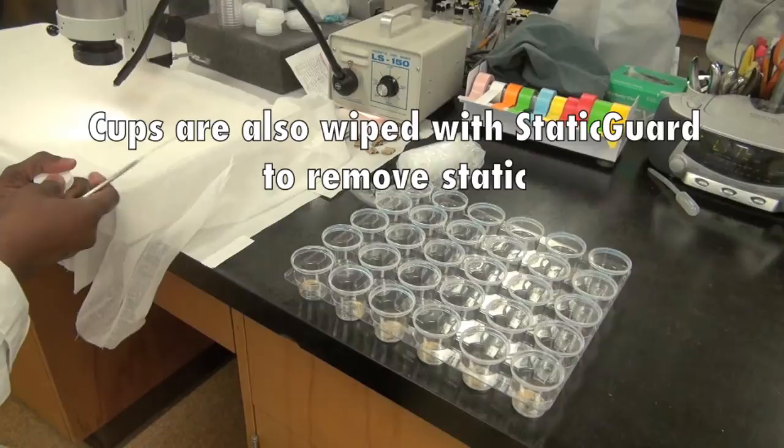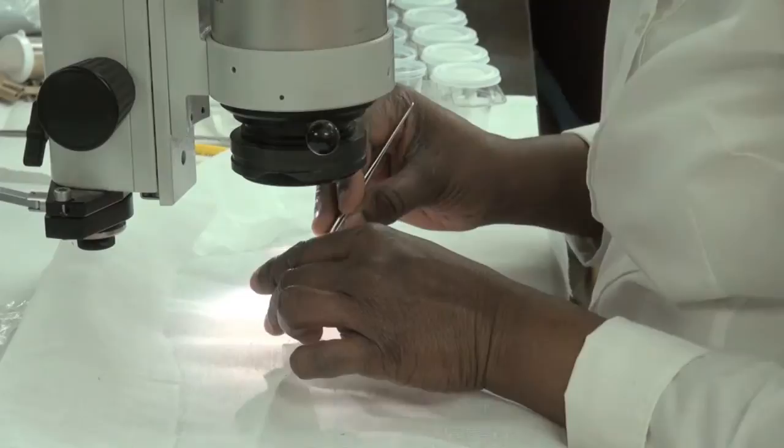We use a forcep to extract the eggs from the cheesecloth, and then each cup gets one egg.